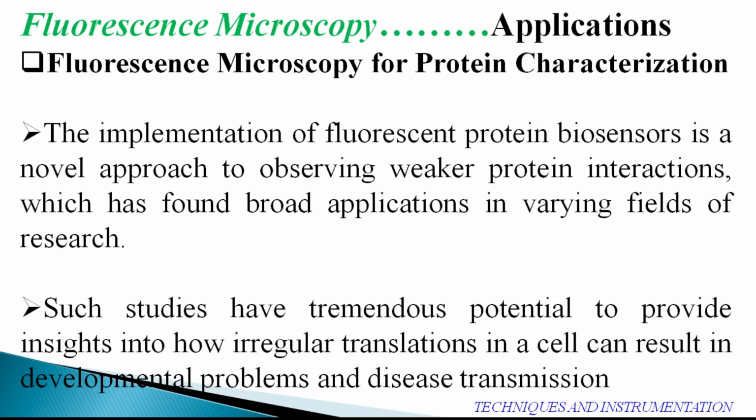Due to this uncertain, unexplored chemical nature of autofluorescence, fluorescent microscopy was recently tried for investigations on dental hard tissue.